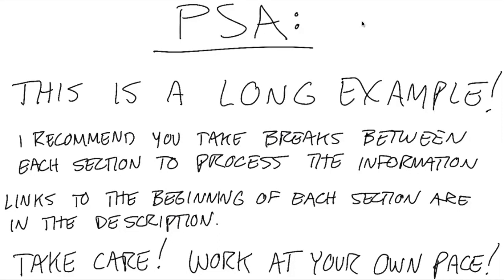Hey everyone, welcome to our fourth and final worked example where we're going to go through yet another full spectral assignment. Just to give a little PSA before you begin this video, it's a long video. This is a really long example problem. So I recommend you don't need to sit through this whole video all at once. In fact, I recommend that you don't do that.